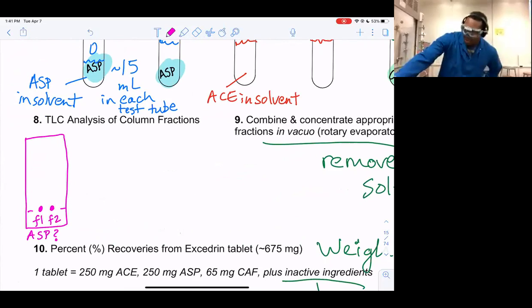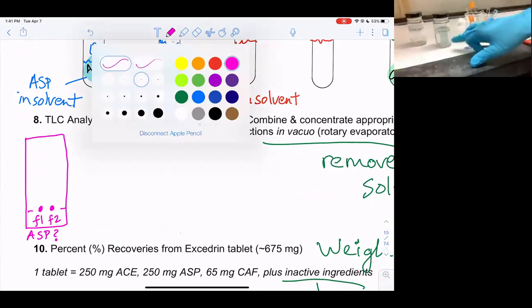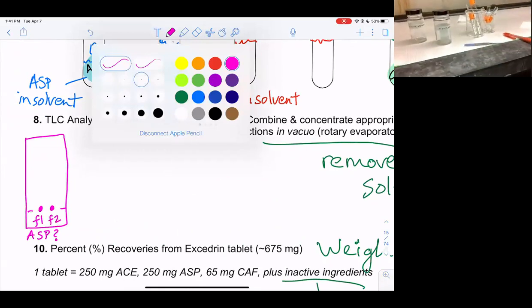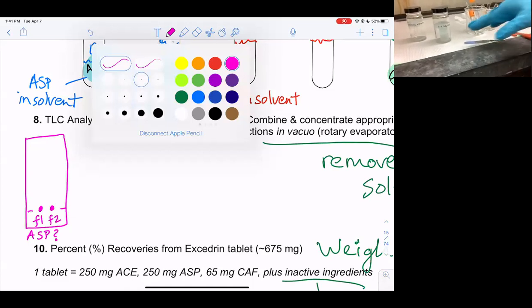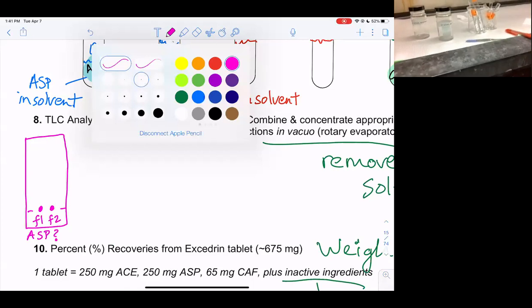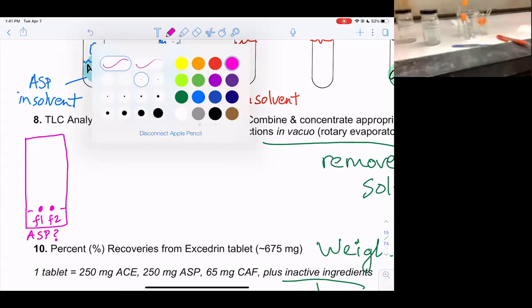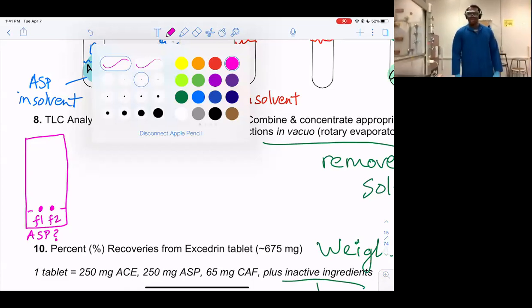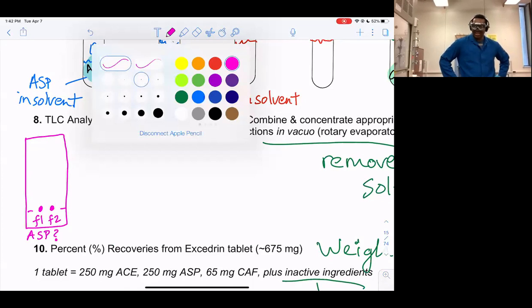But look at it now, actually. Can you show them this now? So the thing on the side that was kind of raised has equilibrated now, because it works via capillary action, and generally the solvent level will equilibrate as you go higher on the plate. So now it's a little more even. So my screw up has now been fixed through science. So that's all I have for now. It's Aniebok signing off.